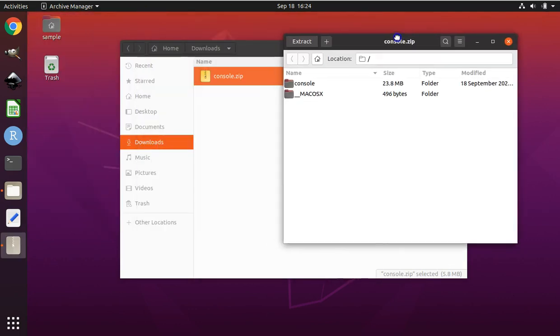This folder is contained within a compressed zip archive so that it takes up less space. In this archived format, the files within this folder are not accessible to the computer. We need to uncompress this folder out of the zip archive. Let's uncompress this folder to our desktop.